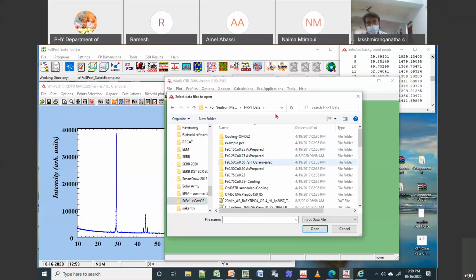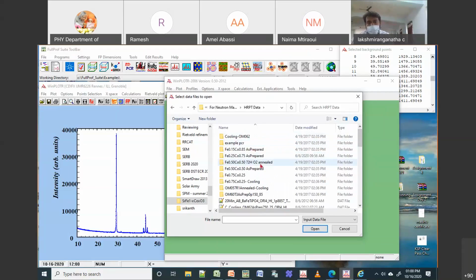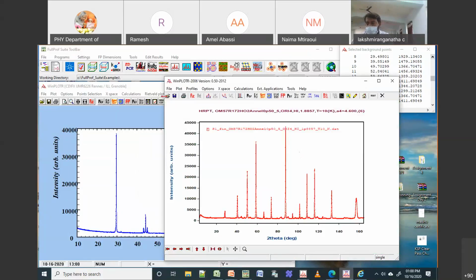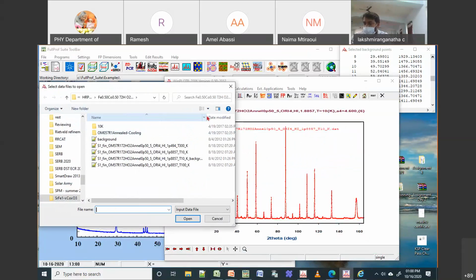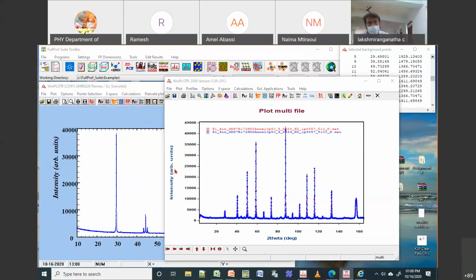I will take an example where we can have the same X format. X in the sense step size has to be the same. If you are having different steps, then this won't work. That is the reason you need to have the same format. And you should have at least 3 to 4 data points. If not, it won't work.